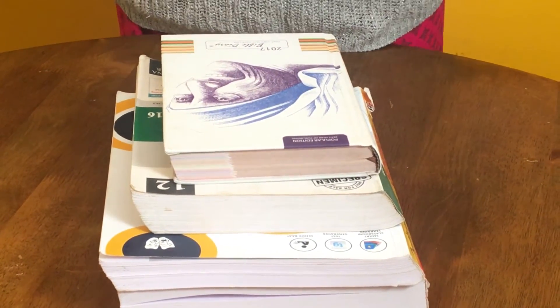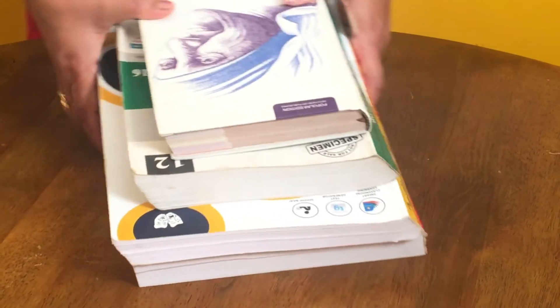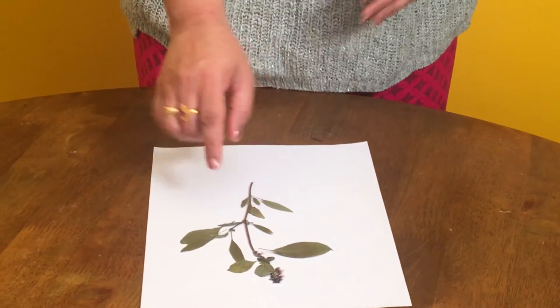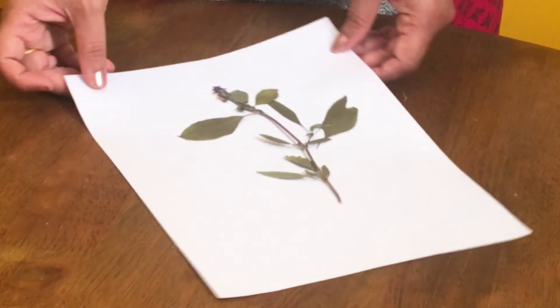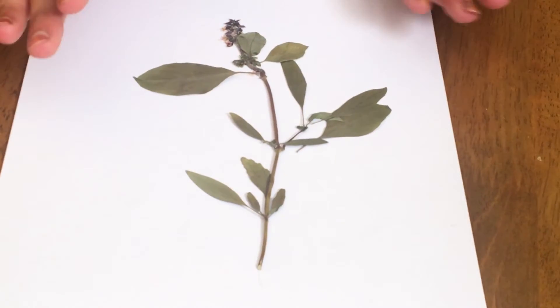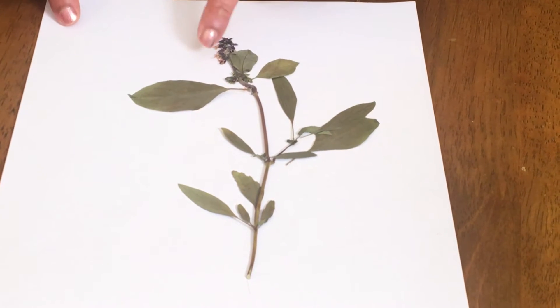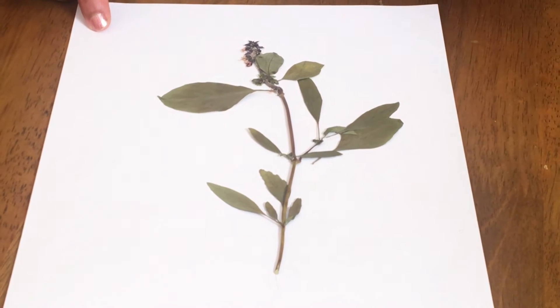After one week you will be getting a dried and properly pressed plant specimen. I will show you one specimen that I have already done — it took one week. This is a plant specimen I prepared a week before and I kept it on an A4 size paper — you can also use a white chart paper. You can see that this plant specimen exactly fits on this page. This is a tulsi plant. You can see the inflorescence, all the leaves and the branch. Perfectly dried.